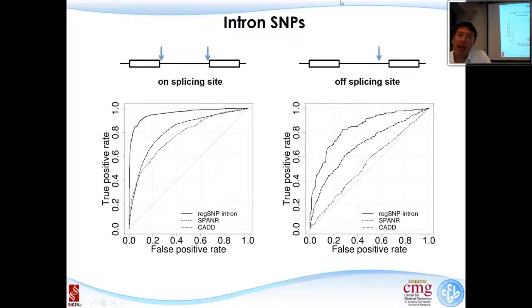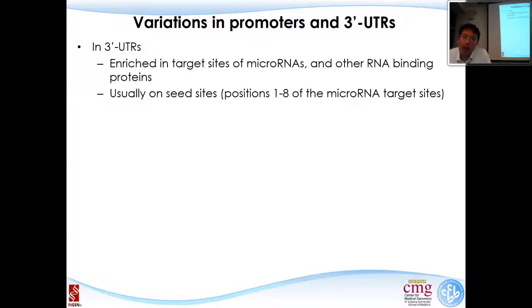And similarly, we also developed another tool that looks for the SNPs in the intronic regions. You can see that, I mean, the color is not very nice, but the outside ones are the ones offered by our predictor, compared to two others using existing tools. And of course, those are the synonymous SNPs. Those are SNPs that potentially will change the amino acid or change the splicing outcomes.